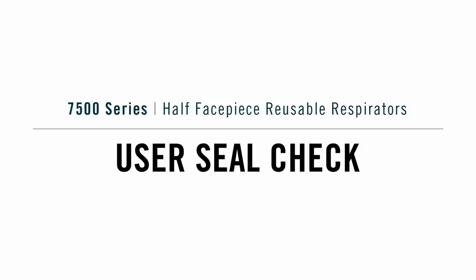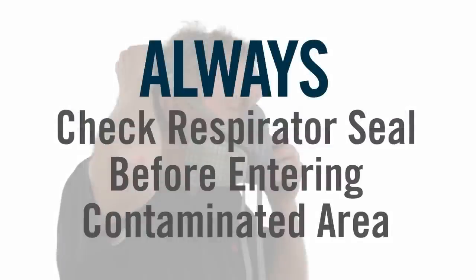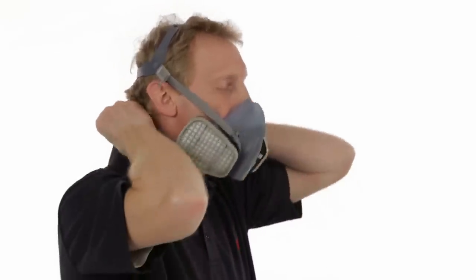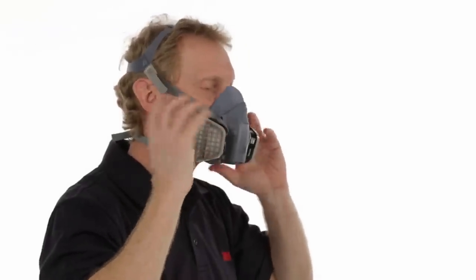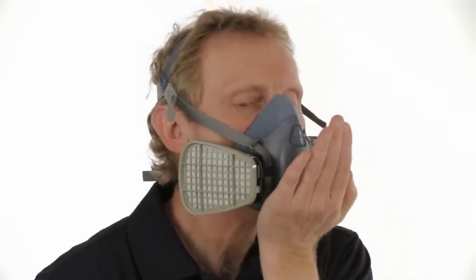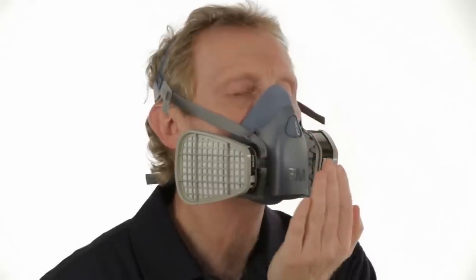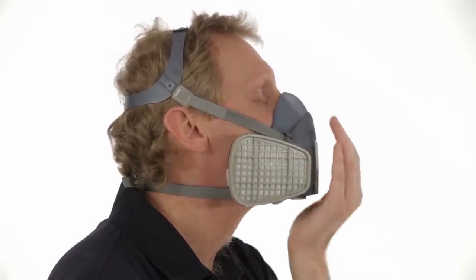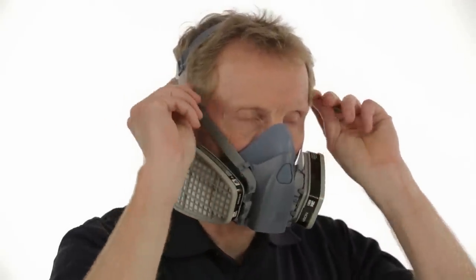Always check the seal of the respirator to your face before entering a contaminated area. You must perform either a positive or negative pressure user seal check. To perform a positive pressure user seal check, place the palm of your hand gently over the exhalation valve cover, being careful not to apply too much pressure and disturb the face seal. Exhale gently. If the facepiece bulges slightly and you feel no air leaking between your face and the face seal, your respirator has sealed properly to your face.